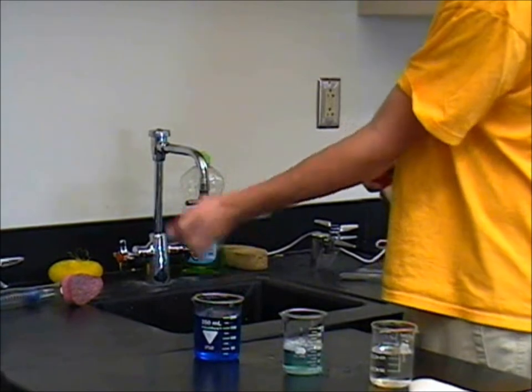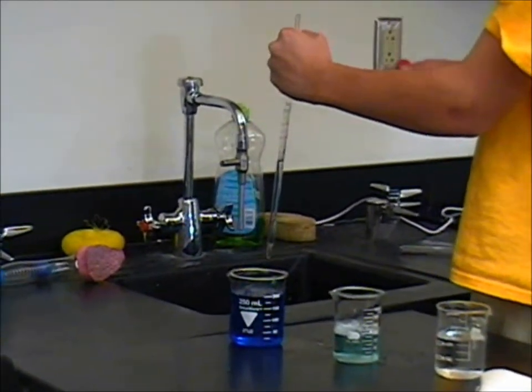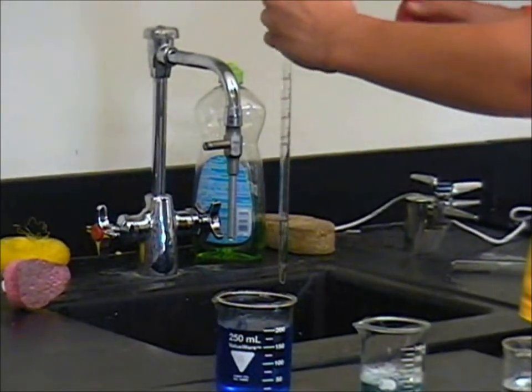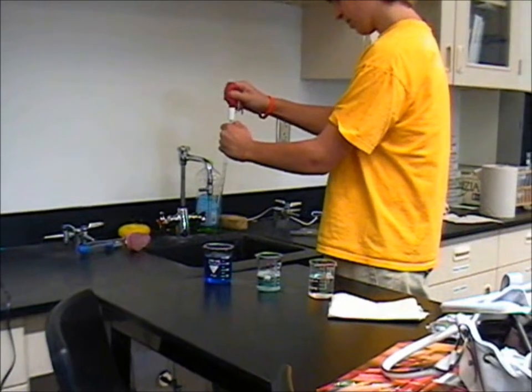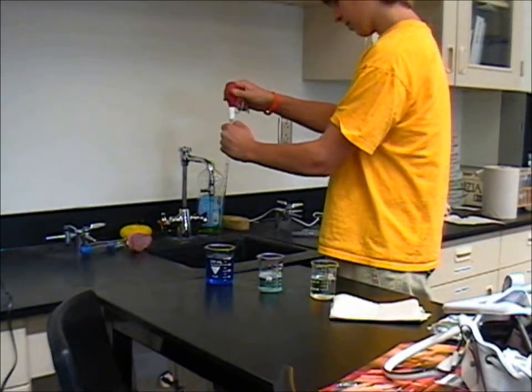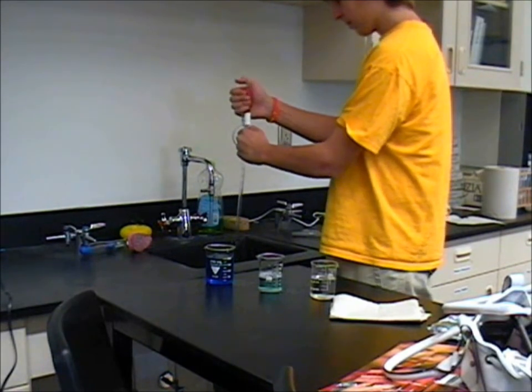Get rid of all the solution by releasing your thumb over the sink. Put the bulb on top of the pipette and squeeze out the extra solution. Never release the bulb completely with the solution inside — you should never get the solution inside of the bulb.